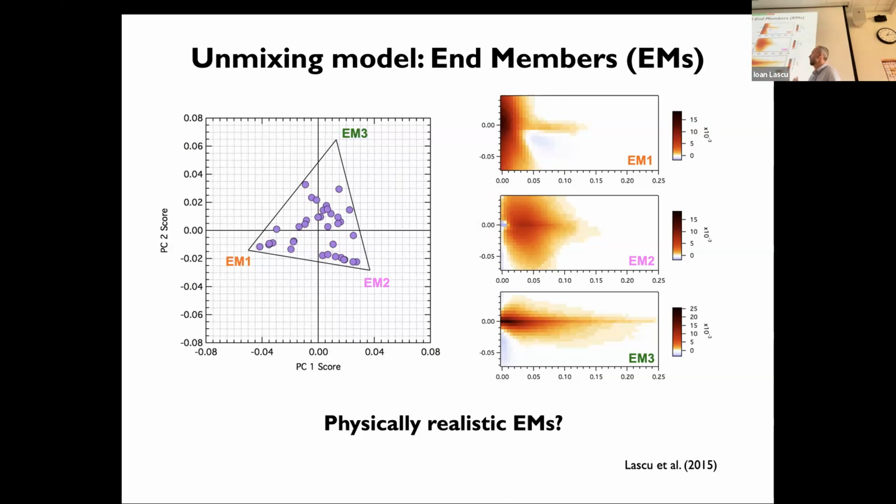And if you have some experience with collecting FORCs, you might say, well, it doesn't quite look right, because maybe there's a negative area here that is not looking realistic. But in this case, since we don't have data points close to that vertex, the top one over there, this is the best we can do with this version.